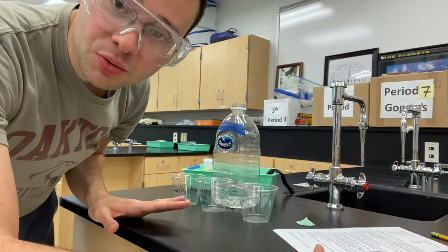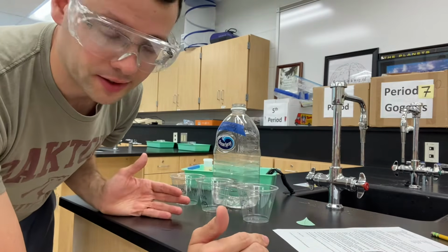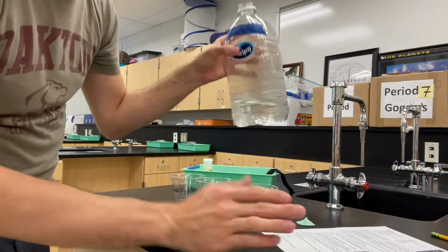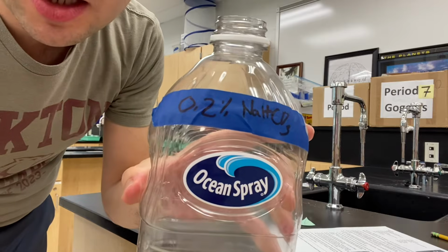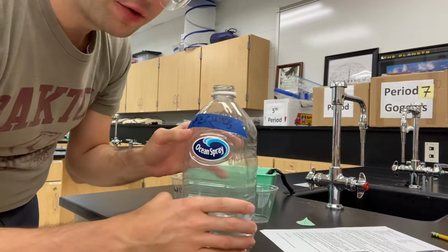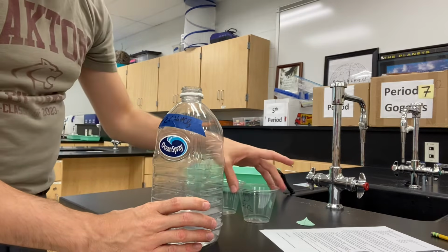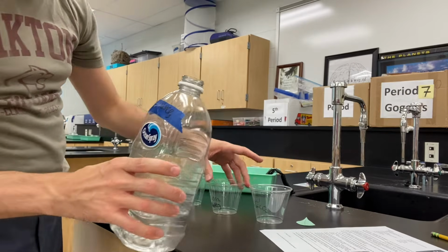All right, what I'm going to show you here is the main setup that you will then modify depending on which independent variable you get assigned. The basic setup is that you will have these containers of bicarbonate. We are going to use a 0.2% sodium bicarbonate solution, and those are already labeled for you at your lab benches.